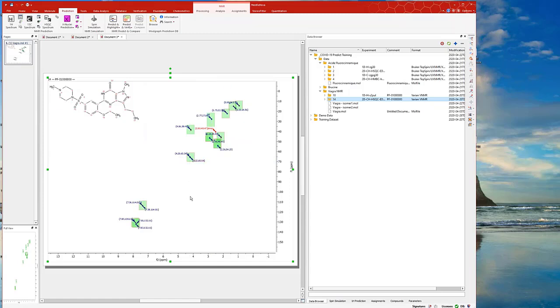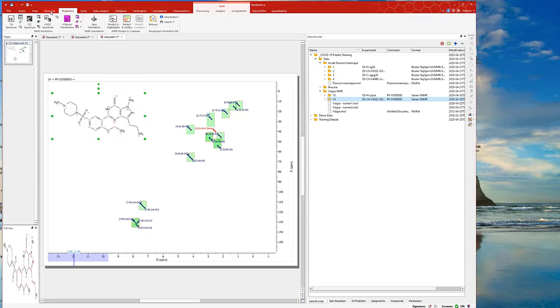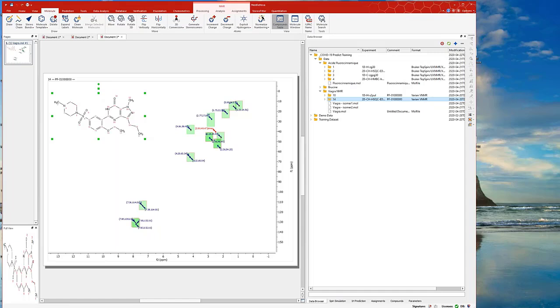So I would say this gives you a simple verification that this structure is probably compatible with the available HSQC here. Now, if we want to have a regioisomer of this, I'm not going to use those molecules because I realized there are some display problems with them. So I'm just going to change the molecule here. It's quite easy to do in this molecule ribbon. I use the delete tool. Suppose I want to delete that bond. I'm going to connect this CH3 and the CH2 to here to make a regioisomer. Oh no, if I did something wrong, I just click escape here. I should use that one to connect the bond here.